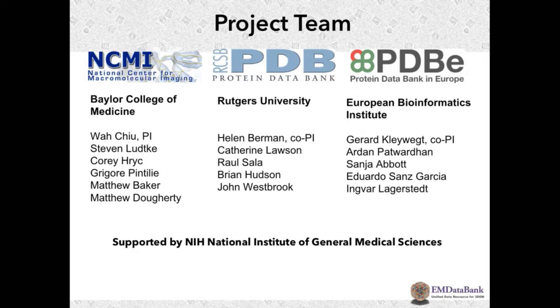Right, to sort of decide whether or not you agree with what they did. You could threshold at that contour level, remove the PDB that's associated with it, and would you be able to say, I could confidently build within that volume? Because that's a big question right now, because a lot of people want to model build these EM maps.